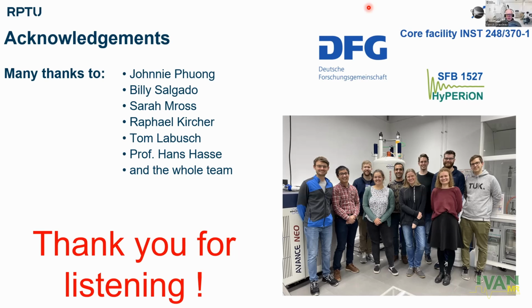I also had a question actually, Kerstin. So maybe my question is nonsense and maybe driven by my lack of knowledge of EPR. But you mentioned at the beginning that we would not get maximum enhancement, we would hope, because we can saturate only one EPR transition. Is that correct? Wouldn't there be a way to saturate more than one transition, for instance, by modulated microwaves or something like that?